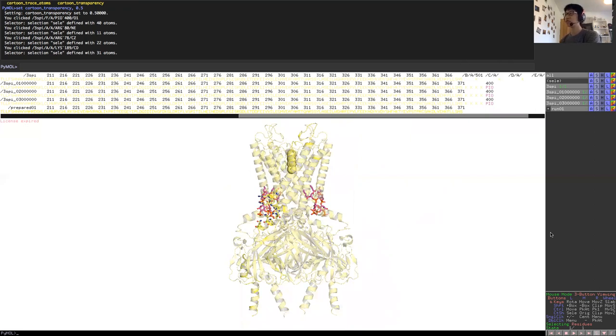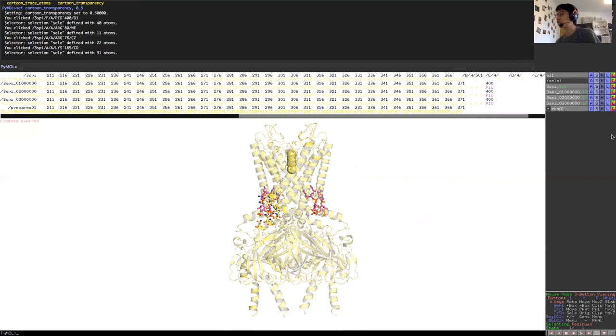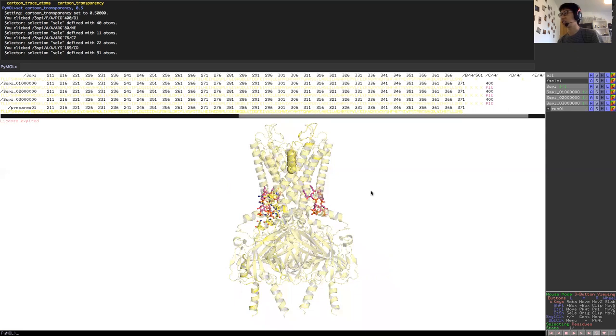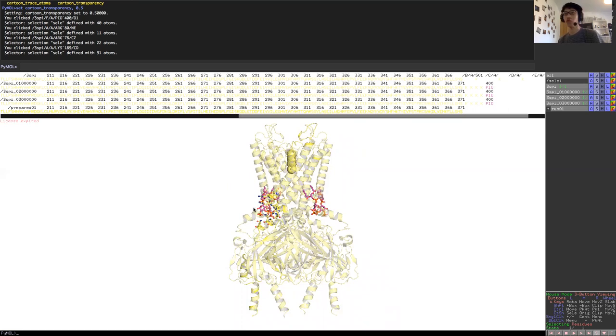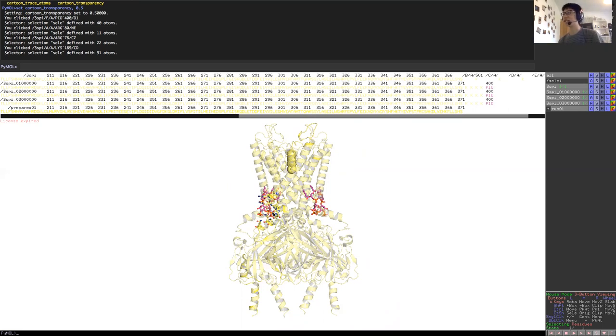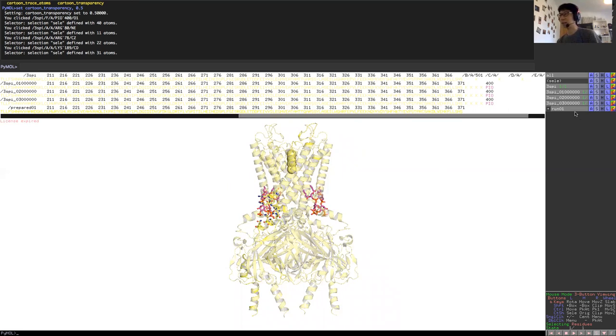What it will tell you in this case is that what you very soon see is that the surface around PIP2 binding site is very positive, which suggests that it is very nice to accommodate this lipid, which is PIP2, which is very negatively charged. By doing this, you can have a roughly vague idea of an electrostatic environment near the ligand binding site that you're interested in using a very simple tool on PyMOL based on the electrostatic structure.